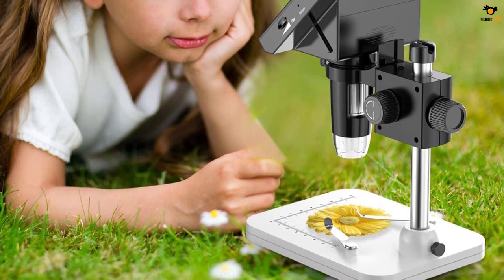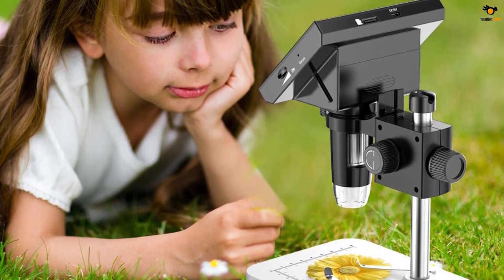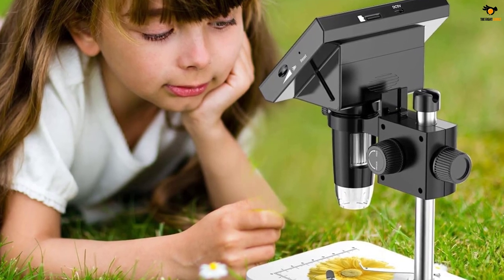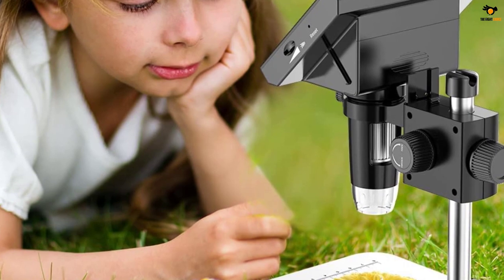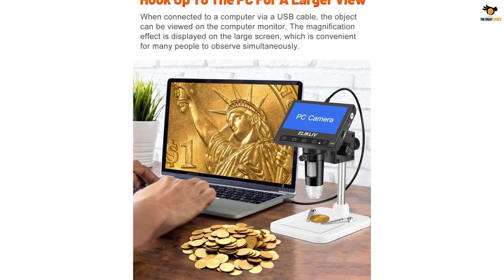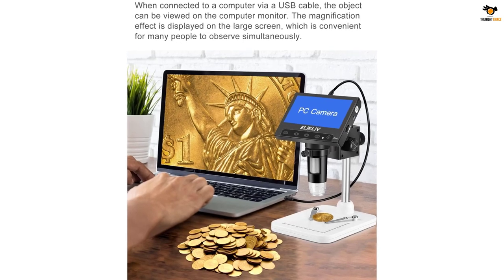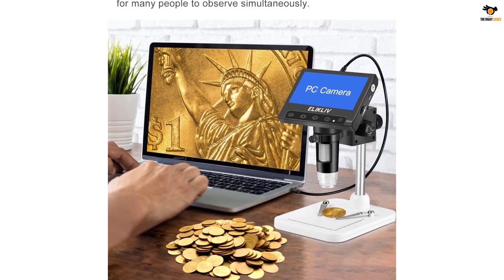Although the lower price tag does mean that you get a small display size of just 4.3 inches, it still offers a pretty decent zoom rating of up to 1000x, which has been made possible thanks to its VGA camera. In fact, unlike what you would expect from such an entry-level offering, this one even offers a one-year warranty to the user.